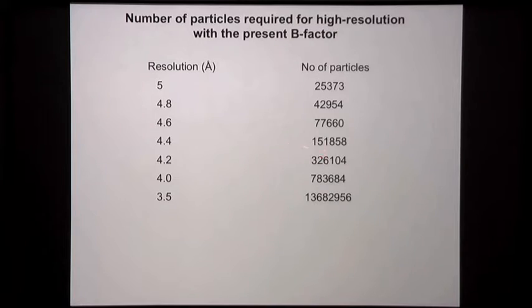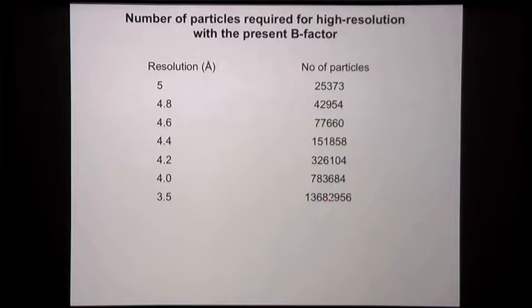This is a guide, but it's not a rule that it's going to follow. It is very useful when you're trying to collect a lot of data. It's better to pause and think about what is happening, and if I add more particles, is it improving or what is happening?